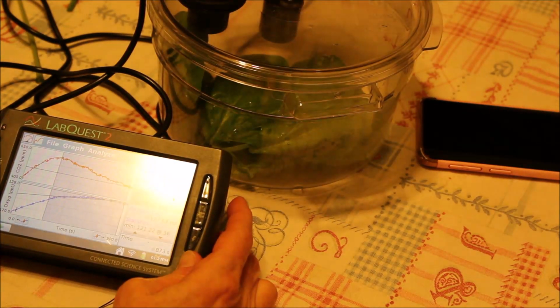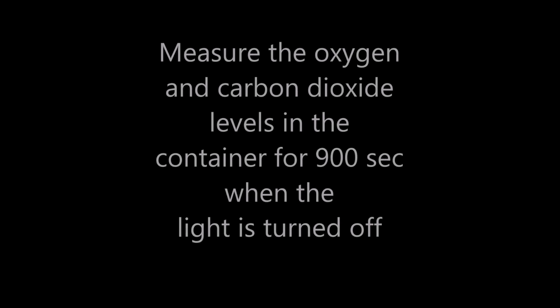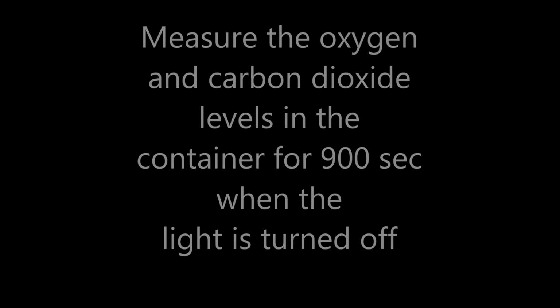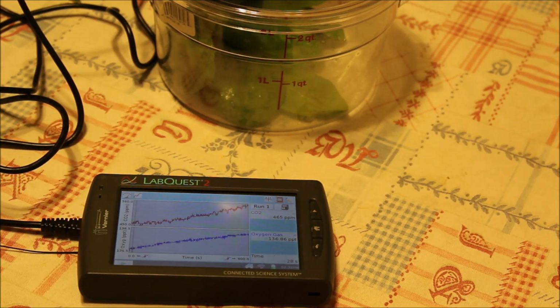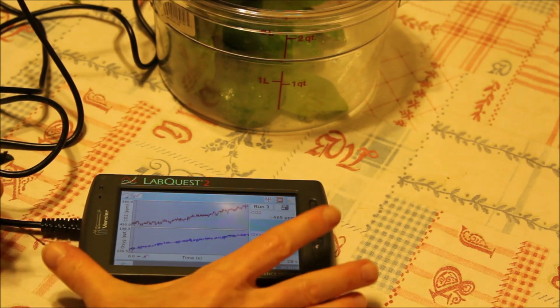You will repeat the measurement in the dark. So this is what I have with the LabQuest.